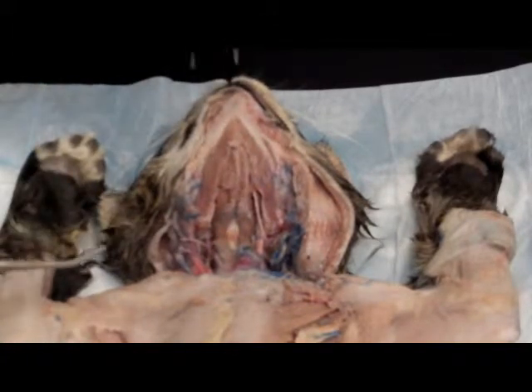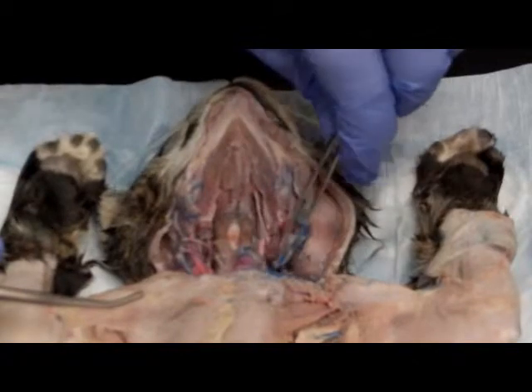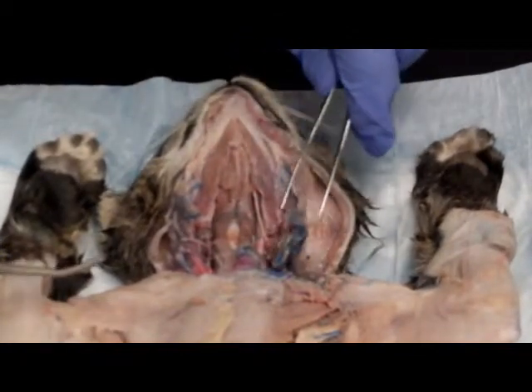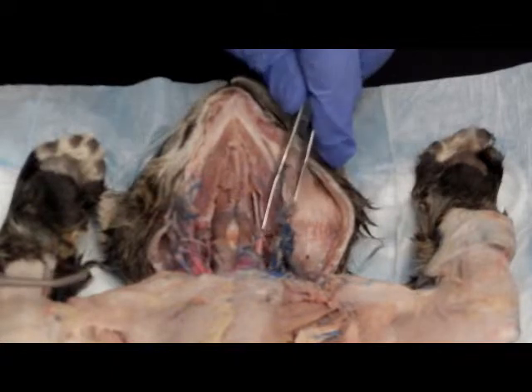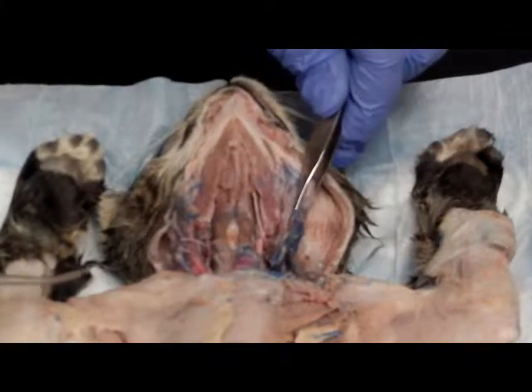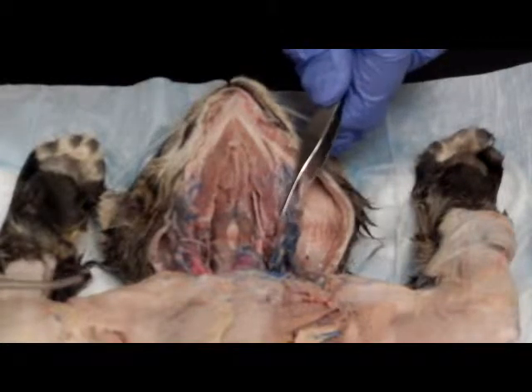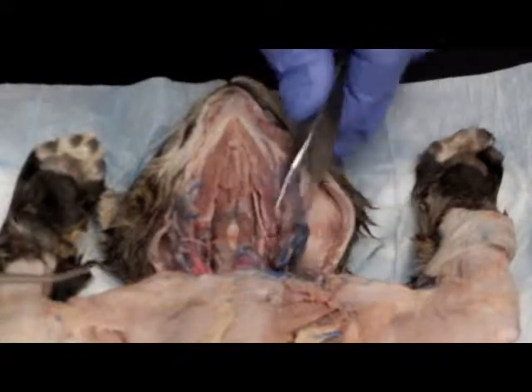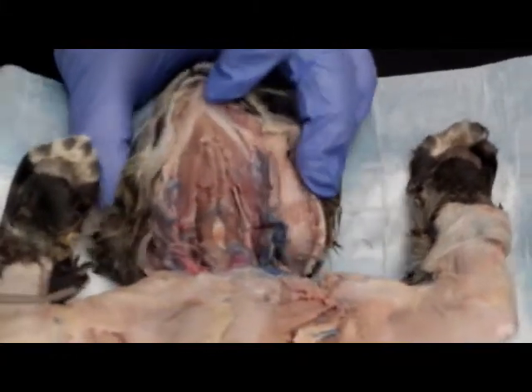The sternomastoids, right here. The origin is the manubrium of the sternum and the medial portion of the clavicle. The insertion is the mastoid process of the temporal bone and superior nuchal line of the occipital bone, and its function is it flexes and laterally rotates and turns head.